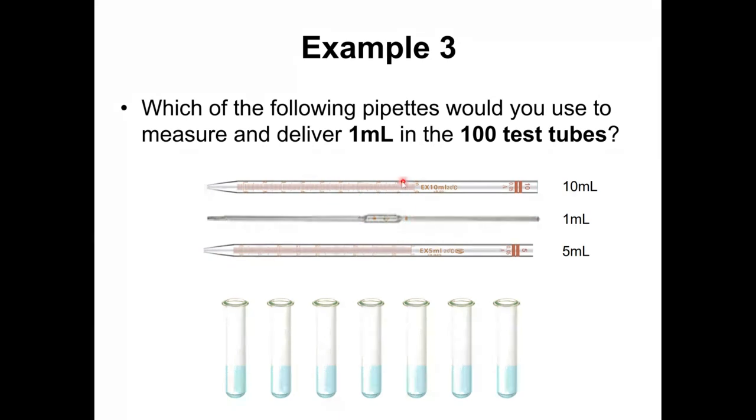By doing that, you will still be accurate enough, not the highest accuracy, but usually with this type of reaction, you repeat the experiment several times, which accounts for increased error. But so you would have to do this 10 times instead of doing 100 times with 1 milliliter. You will go much faster, and your timing will be now compatible with real life lab work. Okay, so sometimes you gotta trade if the task required to do so.